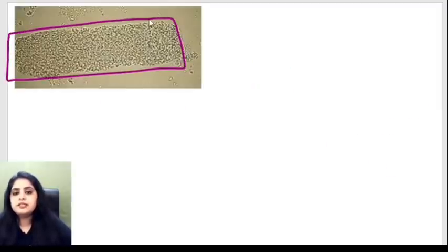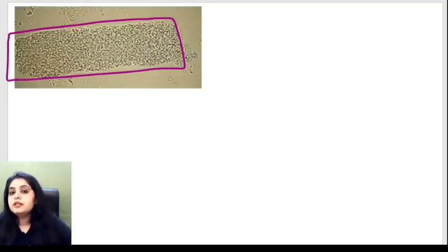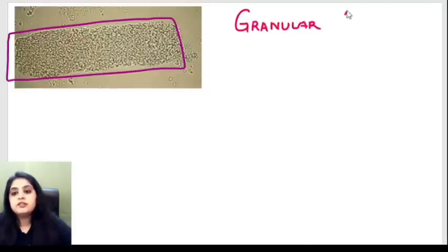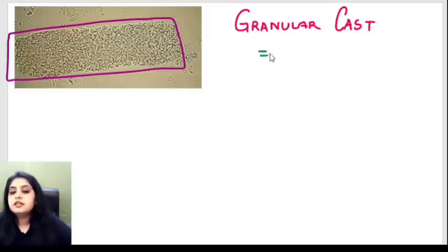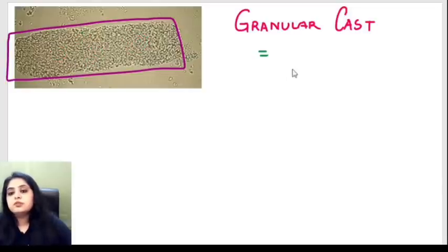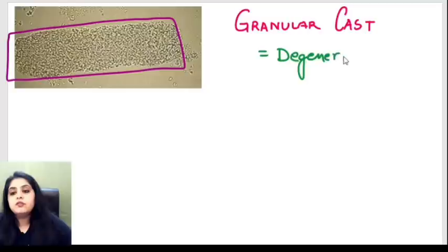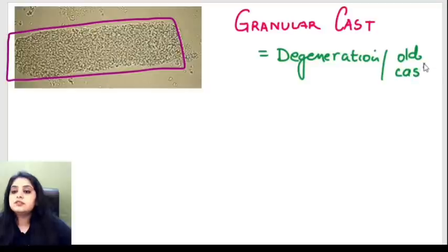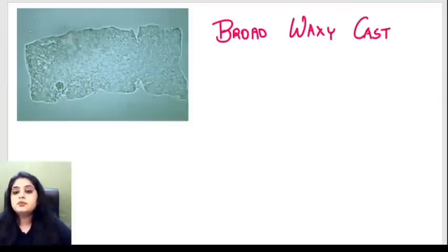This next cast shows some dot-dot-dot material on top but no proper cell — this is known as a granular cast. It indicates that there were earlier some cells (WBCs, RBCs) but those cells have all degenerated. A granular cast basically indicates degeneration of an old cast.